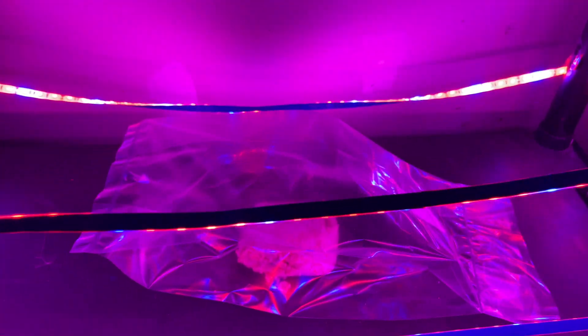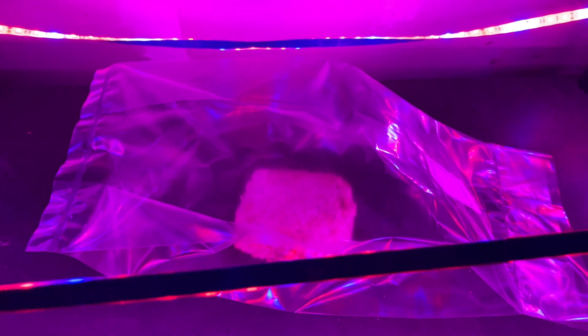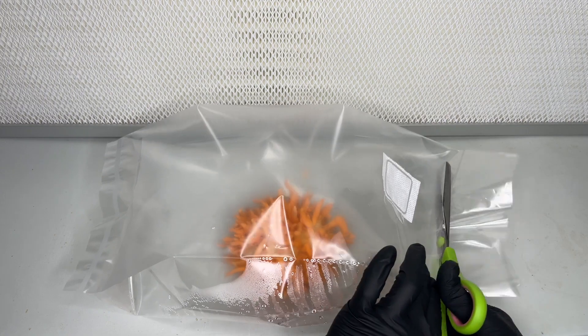The bag is then placed under red and blue LED lights for 12 to 24 hours per day for 50 days. After 50 days the cordyceps is ready to be harvested.